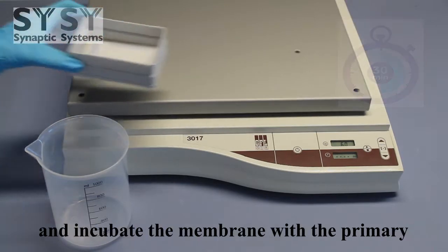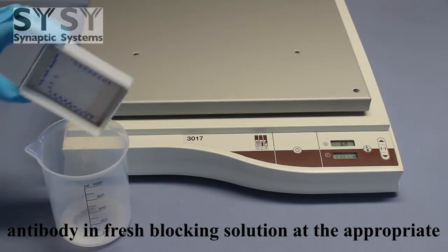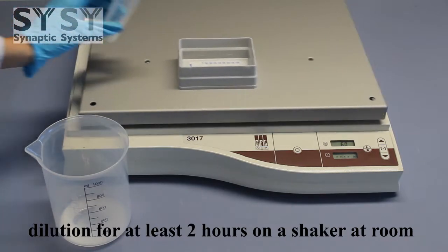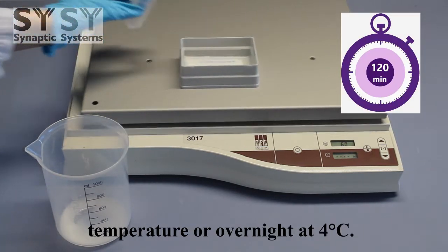Remove the blocking solution and incubate the membrane with the primary antibody in fresh blocking solution at the appropriate dilution for at least 2 hours on a shaker at room temperature, or overnight at 4 degrees Celsius.